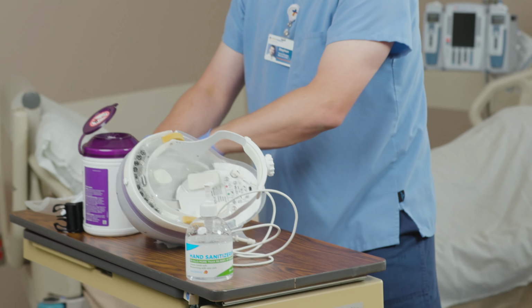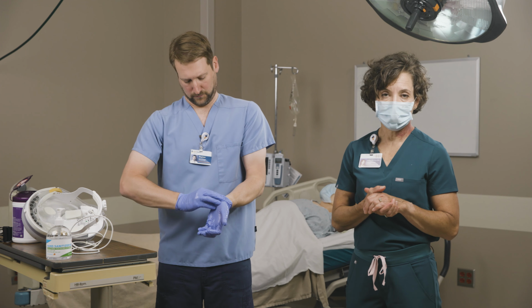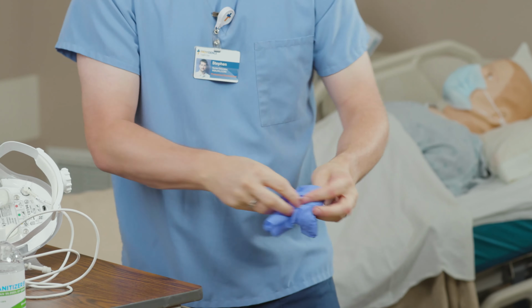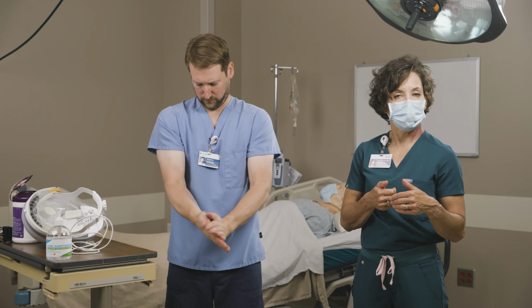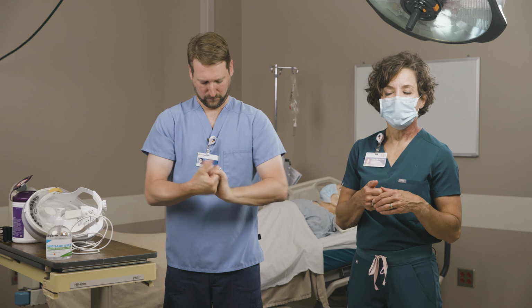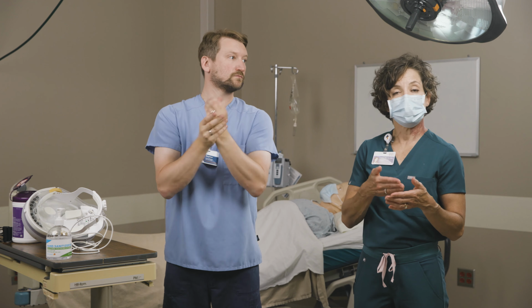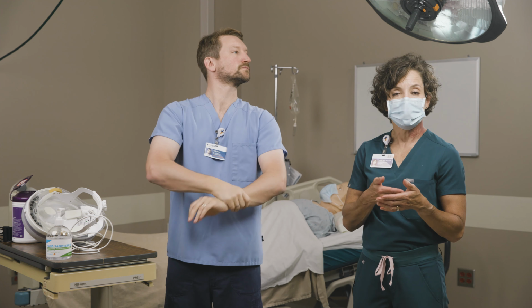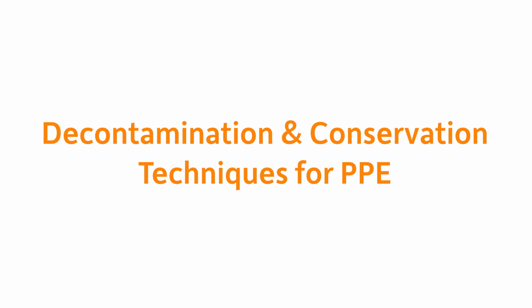Then he's going to perform hand hygiene and doff those gloves and gently discard them. And then he'll finish with hand hygiene. As with our other donning and doffing PPE ensemble, we just want to emphasize the importance of consistently and slowly going through the process to make sure that you're maintaining safety for yourself.